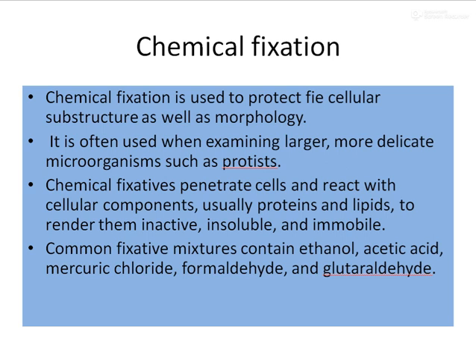Most frequently we use heat fixation, but we can also use chemical fixation when heat fixation could distort the delicate structures you want to view. Even subcellular structures that would be damaged by heat fixation can be viewed by chemical fixation. In some cases you also have delicate organisms that would be lost by heat fixation, and in such cases you can use chemical fixation.